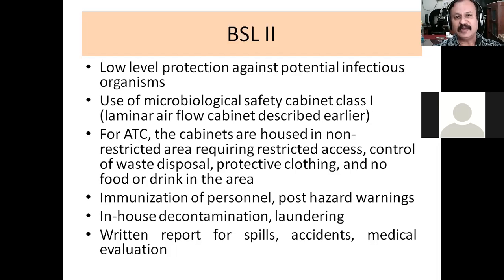So if you feel that your material might contain potentially infectious organisms, you are not sure about it, but there is a slight doubt in the mind that there might be pathogenic organisms associated with the samples, then you are going to maintain biosafety level 2. And in this biosafety level 2, you are not going to use a very sophisticated kind of laminar airflow cabinet, but you can do well with the class 1 biosafety cabinet or laminar airflow system.